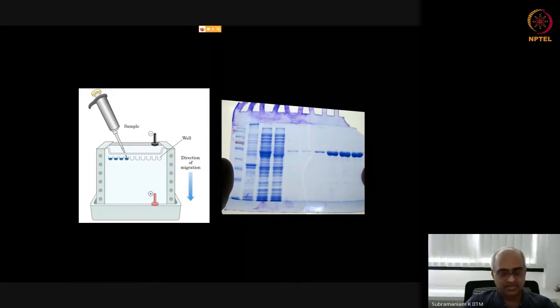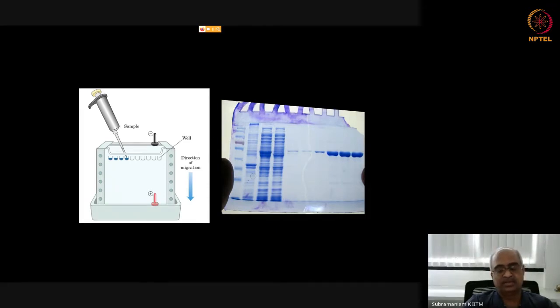The monomer used is acrylamide, and it is not simply a long fiber. It gets cross-linked by the presence of bisacrylamide, which can covalently link on either side to two growing chains of acrylamide polymer. This cross-linked mesh-like structure is what finally is the gel.